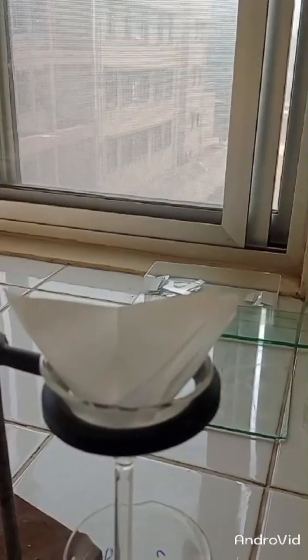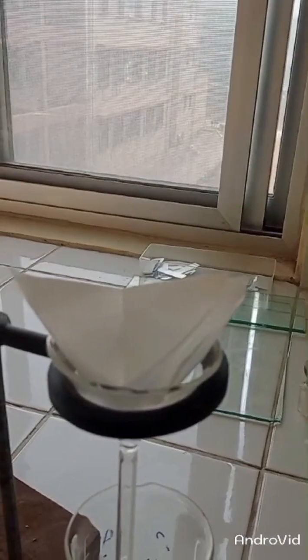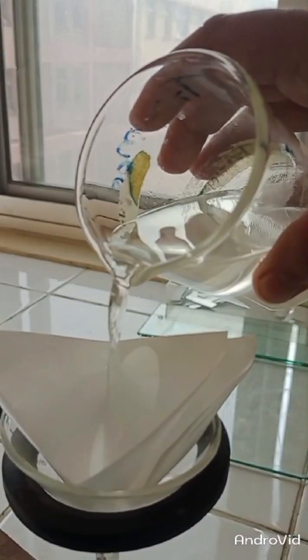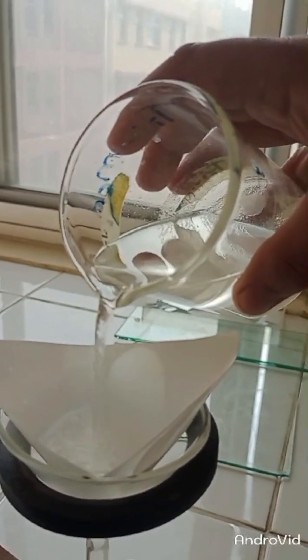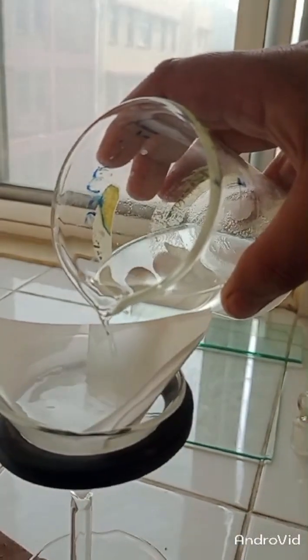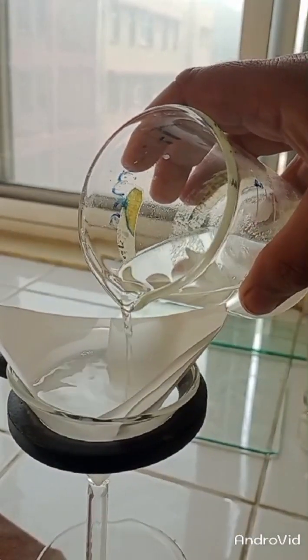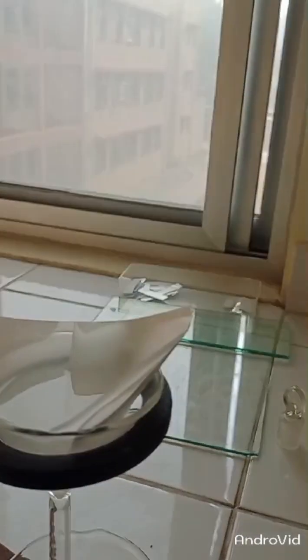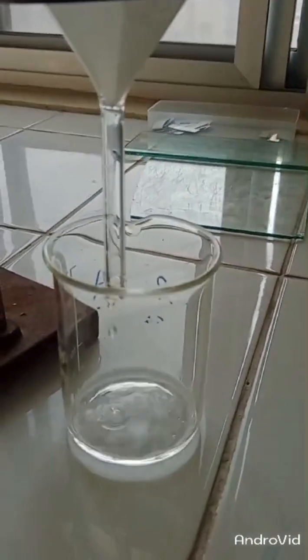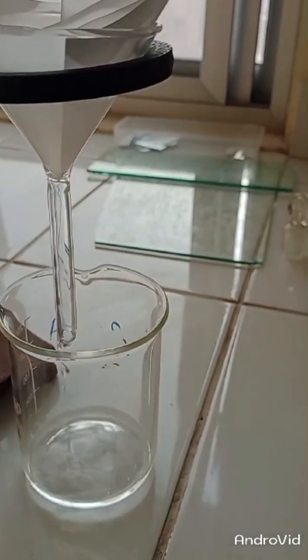In this last stage, we filter our organic product. The sodium sulfate and all insoluble impurities will be separated from our organic product. The organic product along with the solvent will be collected in the lower beaker as our filtrate.